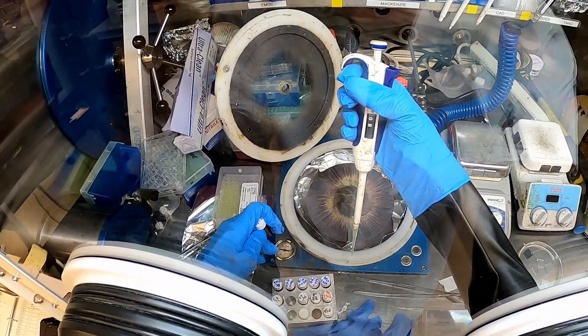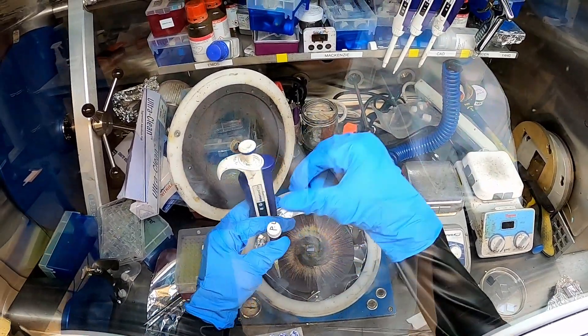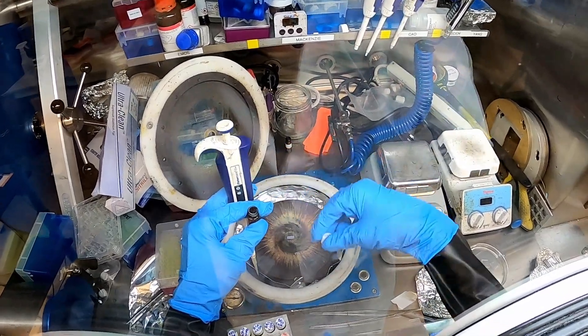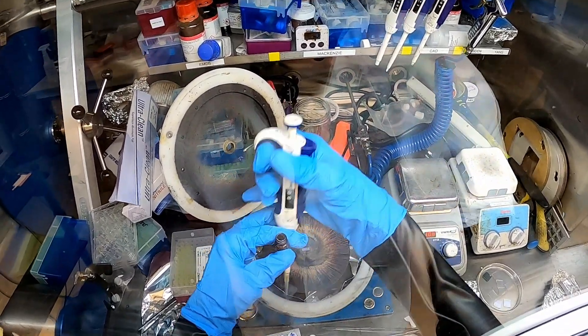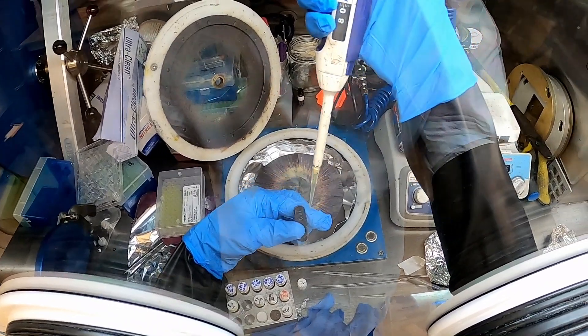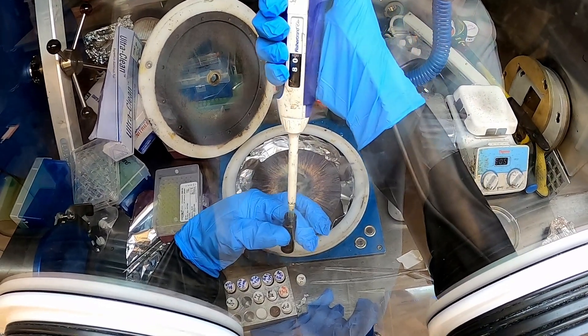Then we'll withdraw yellow perovskite precursor solution from a glass vial and deposit the solution carefully onto the substrate, ensuring to cover the entire substrate with solution.